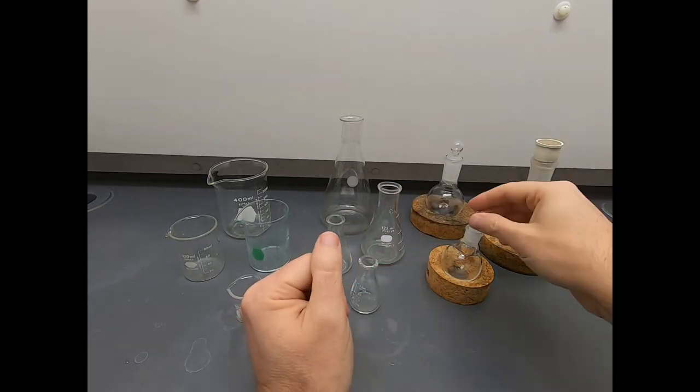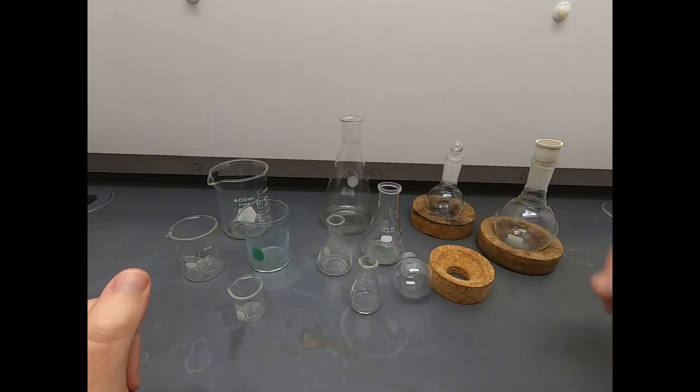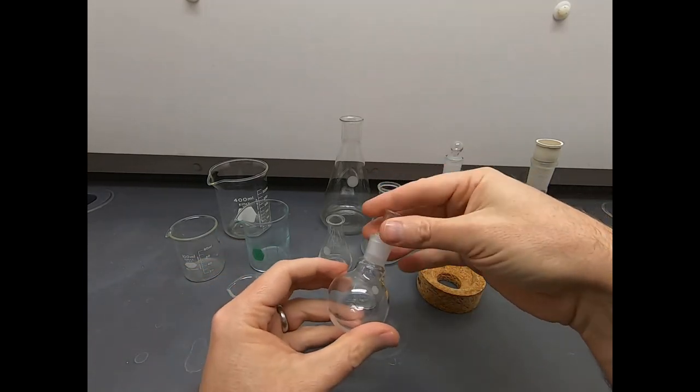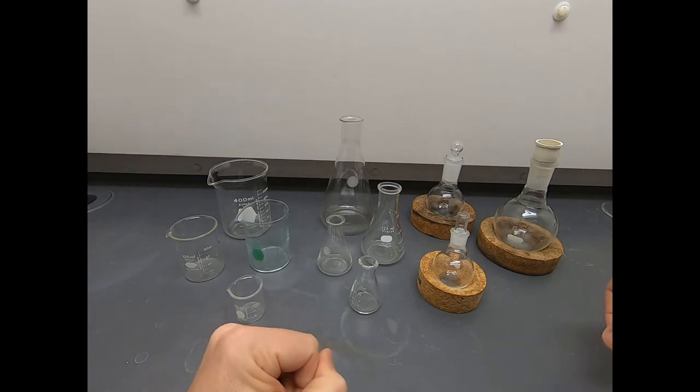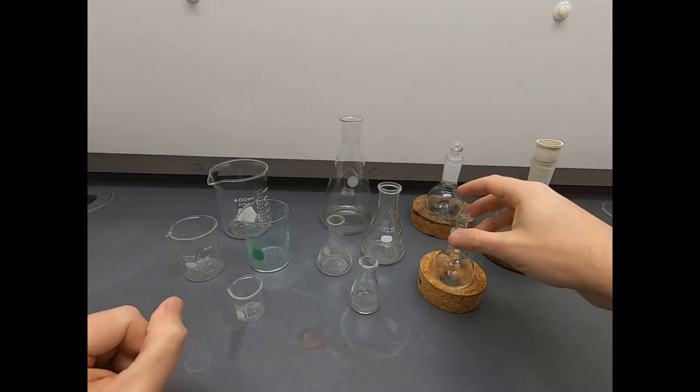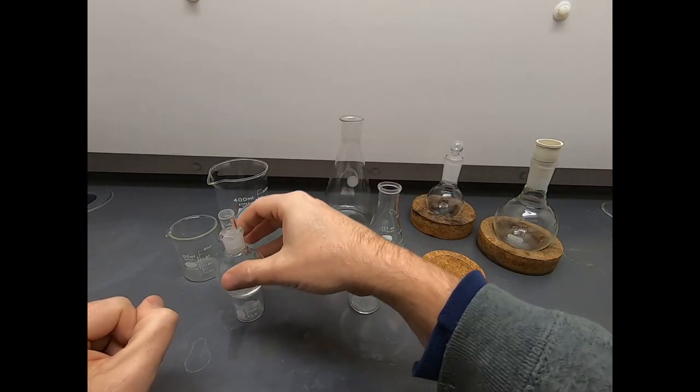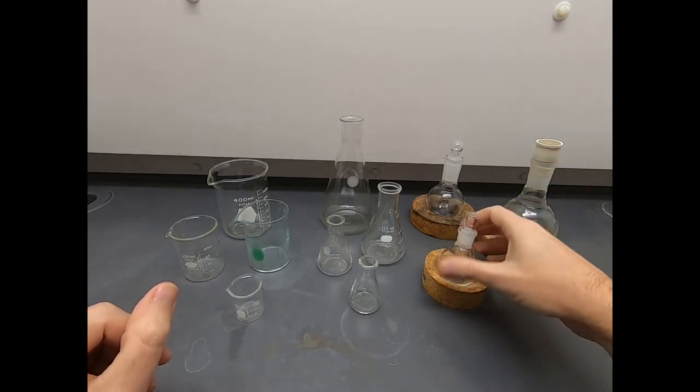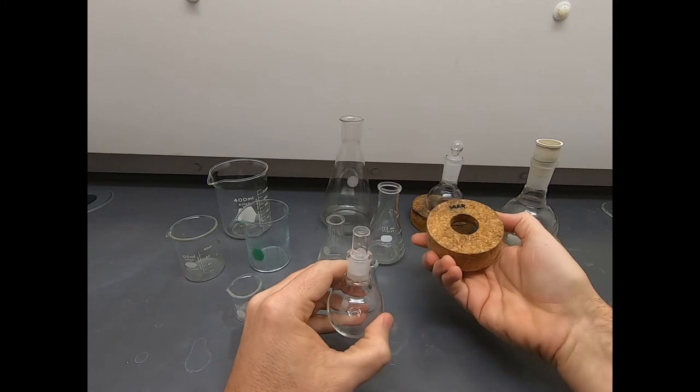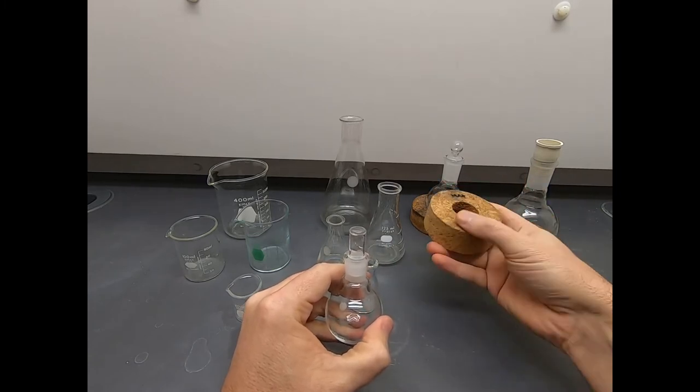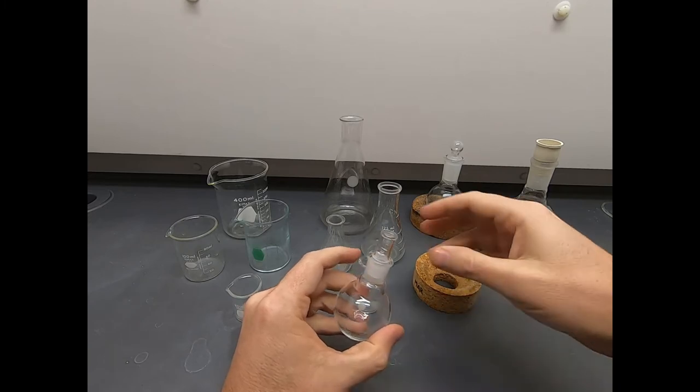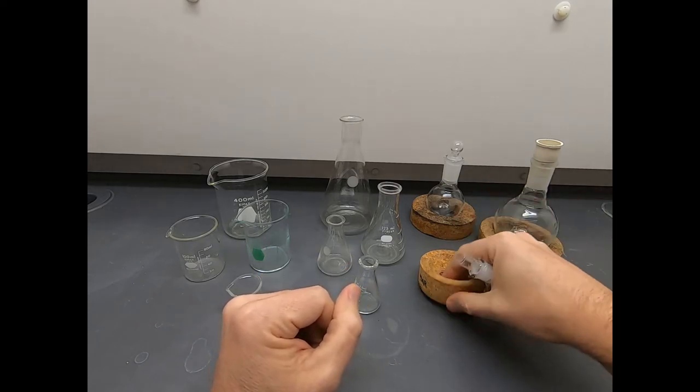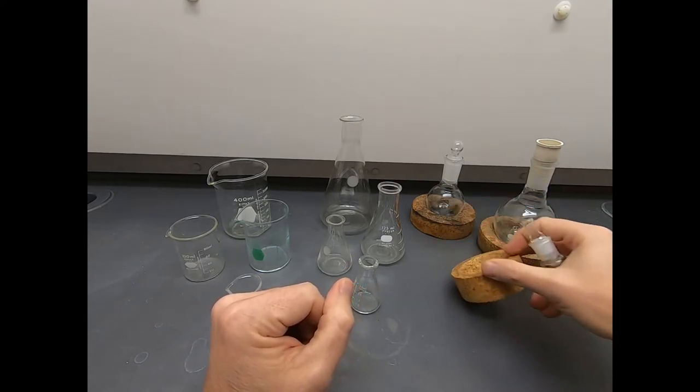Here's a round bottom flask with a septum. Septa are great because sometimes you want to run a reaction and you want to exclude air or moisture, and the septum gives you an airtight seal. You can actually run needles through this to allow the inclusion of other gases besides air. You can include nitrogen, argon, all sorts of things. Note that round bottom flasks don't sit on the bench top very well. They just fall right over. And so for that reason, we use these cork circles to provide a base that will hold the round bottom flask.